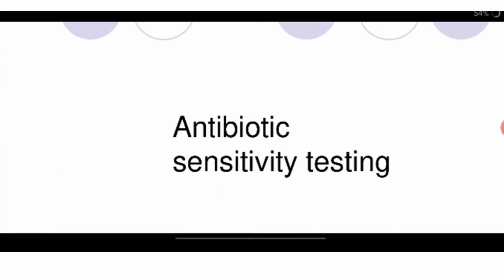Good morning, students. Today we will discuss the topic antibiotic sensitivity testing. This is a test which is done in the microbiology laboratory. This test is very important because it tells us about the antibiotic, its role, and whether it is able to kill that particular bacteria or not.